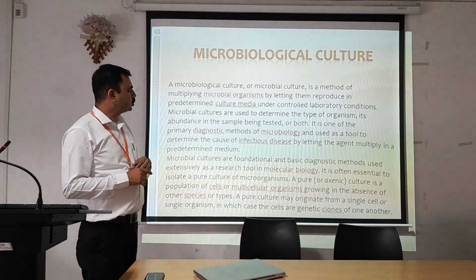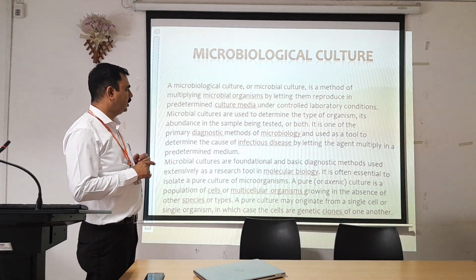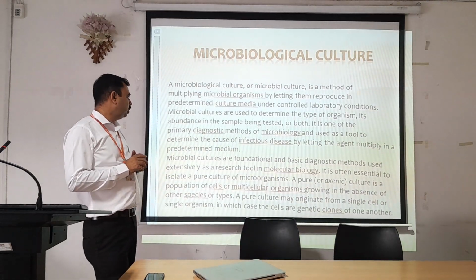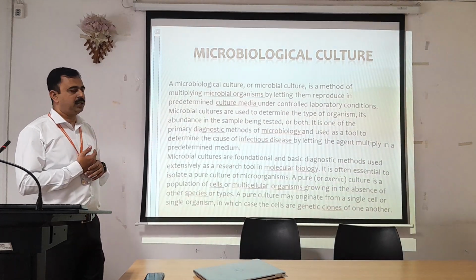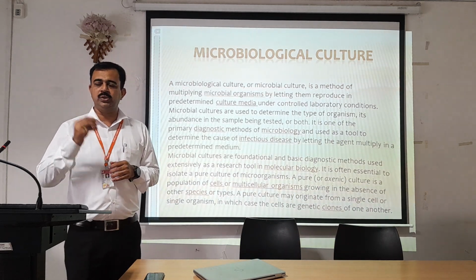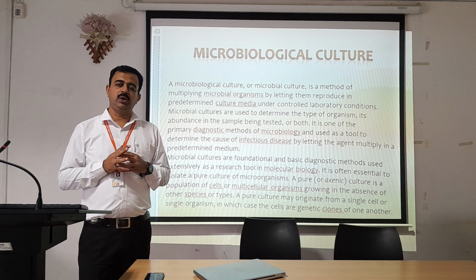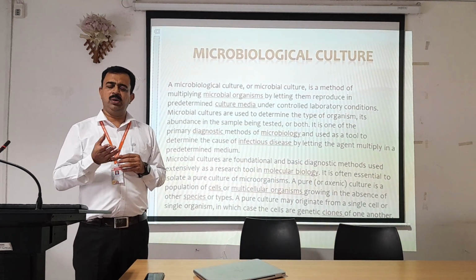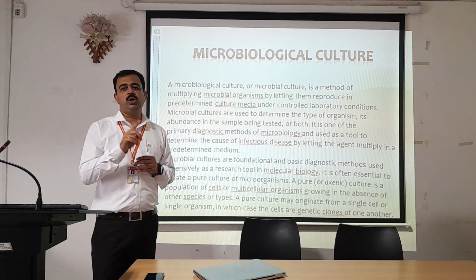Microbial cultures are used to determine the type of organisms, their abundance in the sample being tested, or both. It is one of the primary diagnostic methods of microbiology and is used as a tool to determine the cause of infection by letting the agent multiply in predetermined media. So in order to identify the causative agent from the sample, for example, if a patient of tuberculosis comes and gives a sputum sample, then inside the sputum there may be many organisms, but we should concentrate only on tuberculosis.